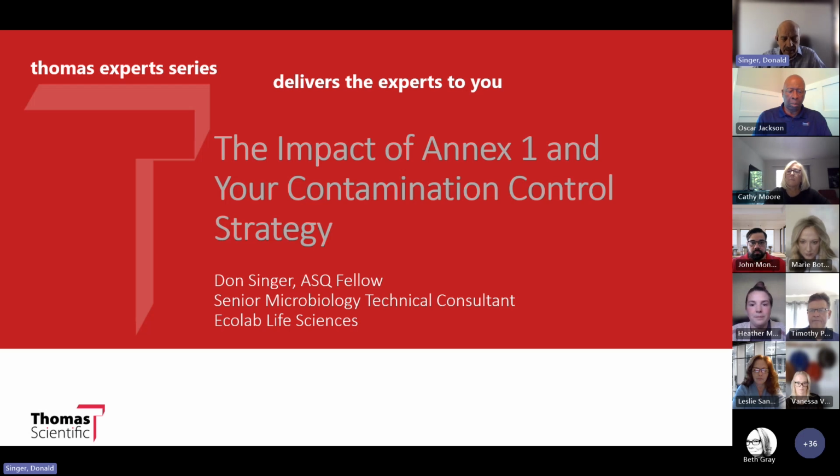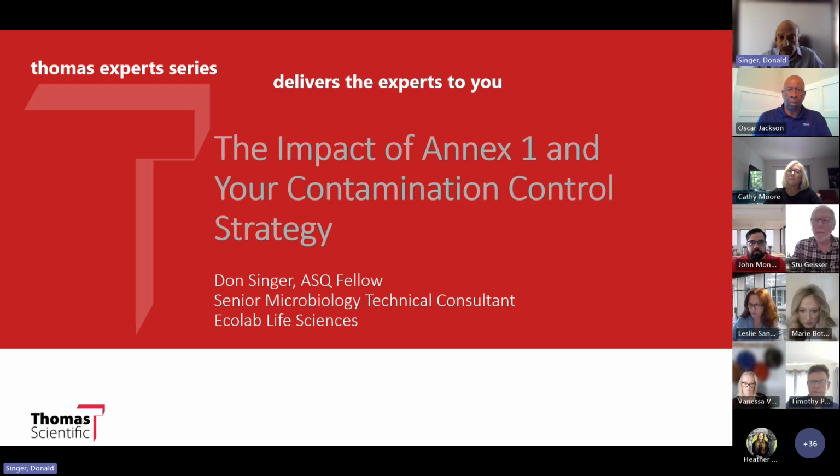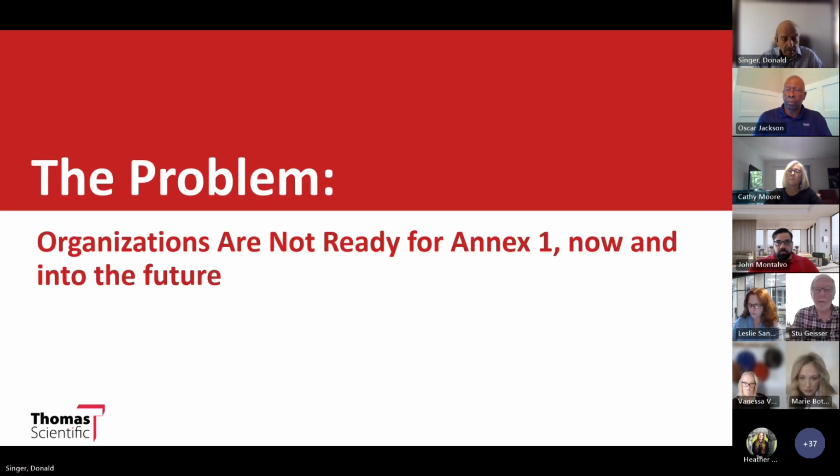This presentation is going to be about Annex 1 and the contamination control strategy. I'm going to discuss the latest Annex 1 revisions and the relevance to cleaning and disinfection practices, the significance of closed processes within this field, as well as what a contamination control strategy is meant to be. Please note that the presentation was put together and directed for your customers' point of view, which means they're pharma and biopharma and cell therapy manufacturers.